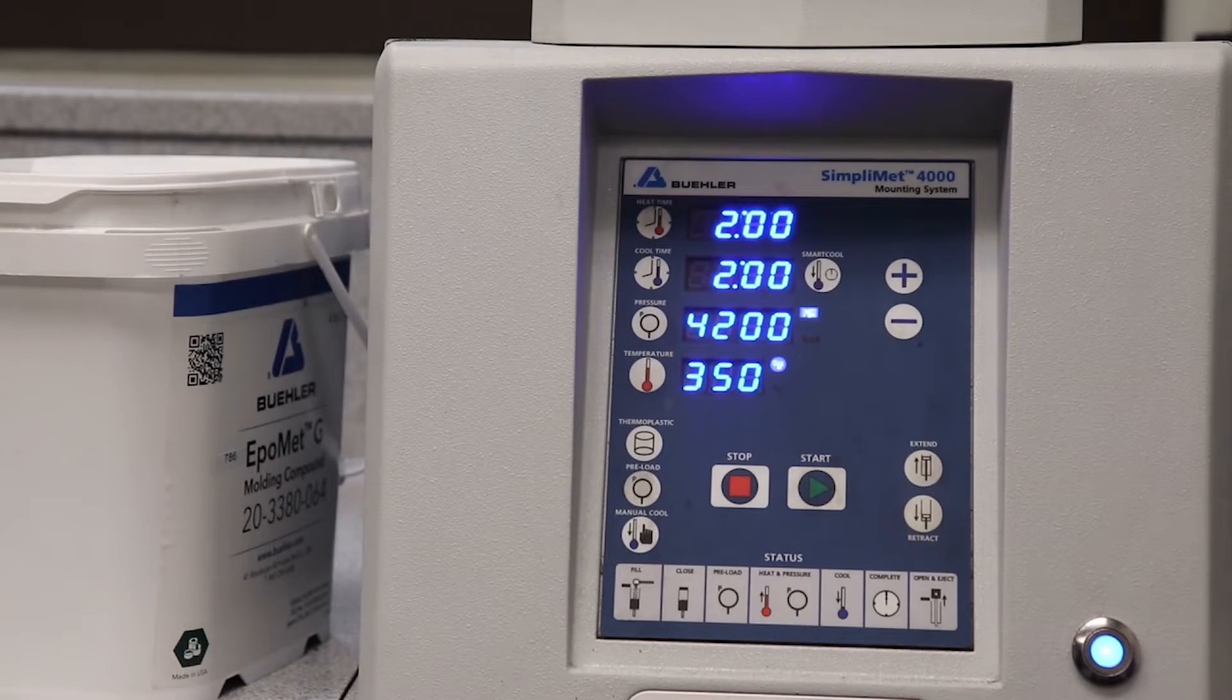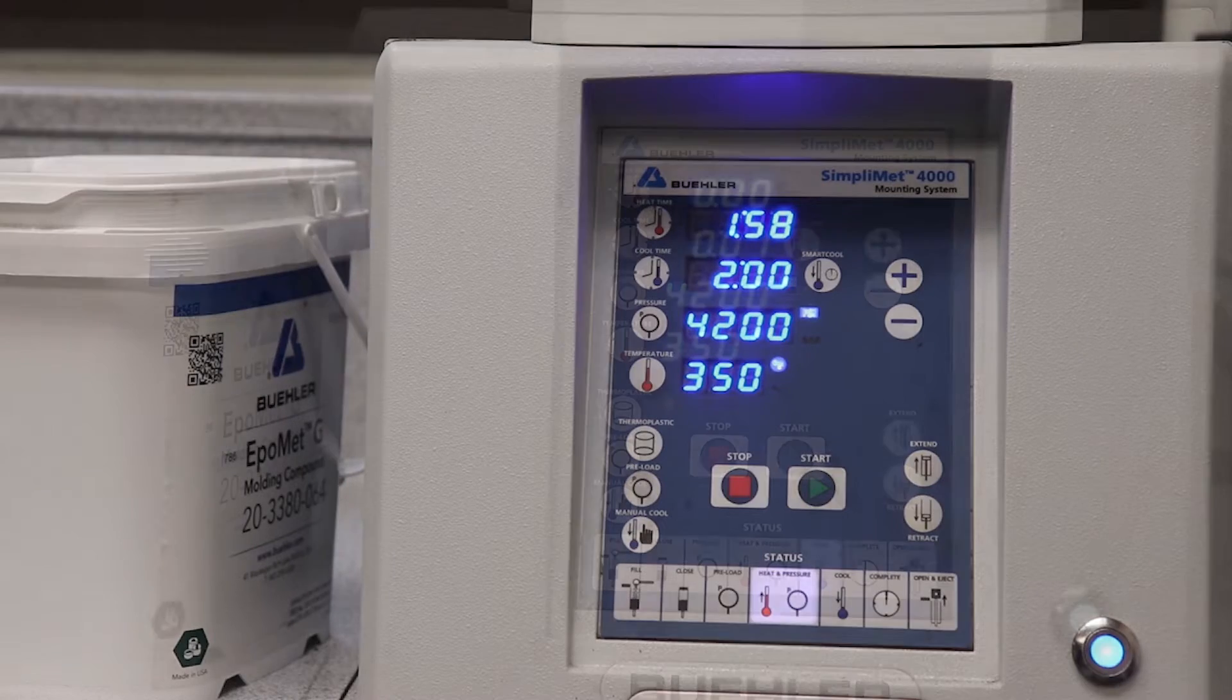The SimpliMet 4000 will indicate the step it is on using the status bar towards the bottom of the control panel.